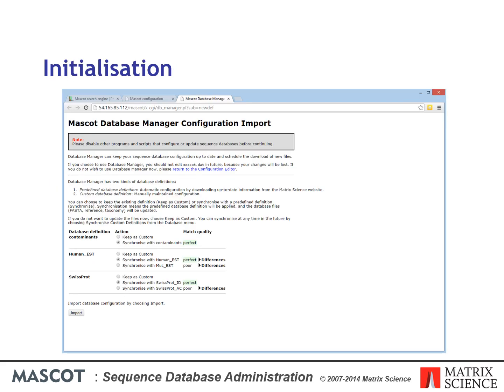Database Manager must be allowed exclusive control of database configuration. Editing Mascot.dat outside of Database Manager will just cause confusion because Database Manager rewrites Mascot.dat whenever a configuration changes. If you prefer to configure sequence databases manually by editing Mascot.dat, then never run Database Manager.